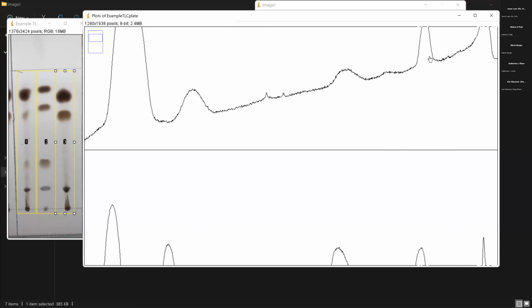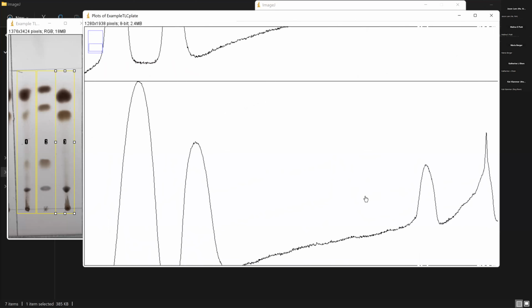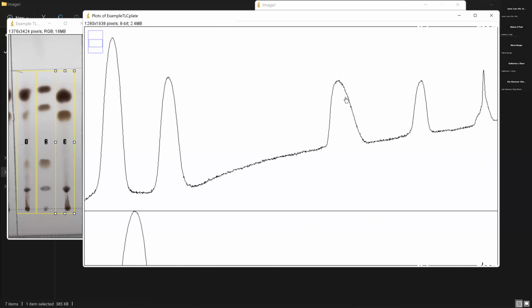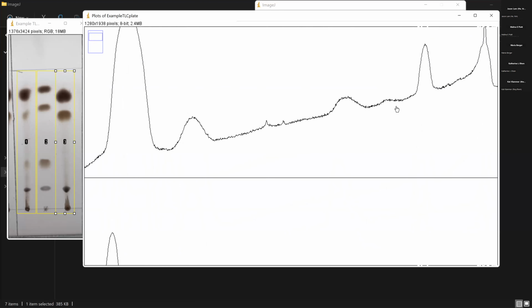Since the HDL is still a sample of your serum, it's still going to have that fatty acid peak because it's still attached to the albumin, whereas we're not going to see it in the pellet because there's none of that serum or albumin in there, therefore the fatty acid is not going to be there. So that's one of the ways we can help confirm that this top chromatogram is indeed the HDL sample.